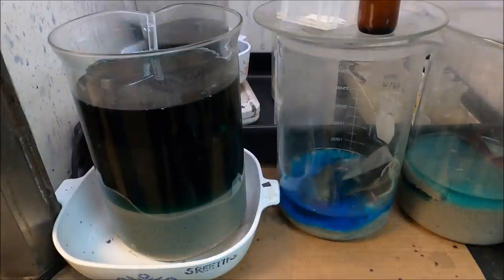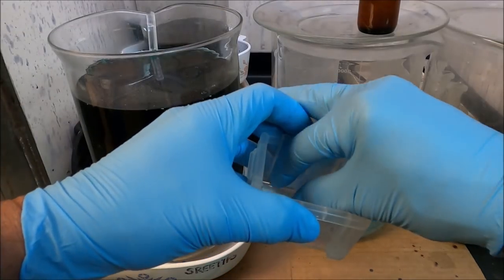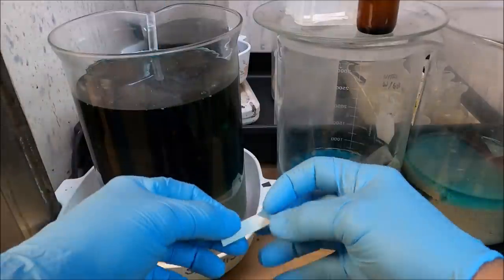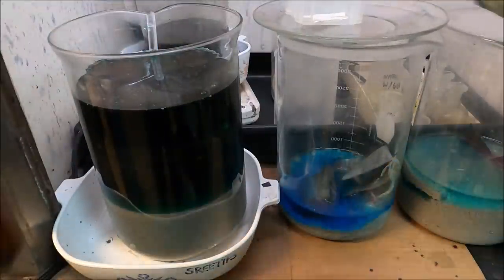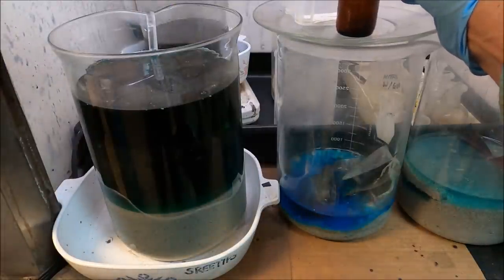Welcome to part five of this series. I've got all the silver cemented out of this solution now. I'm going to dip a piece of filter paper in here and check it with some stannous chloride.